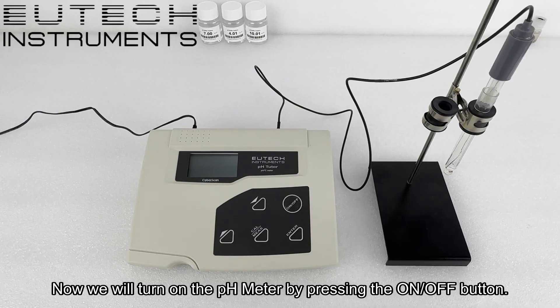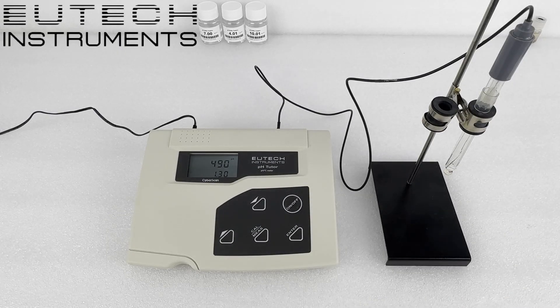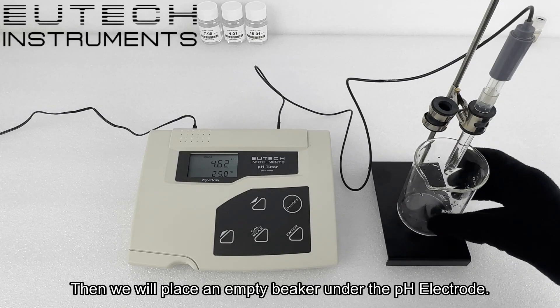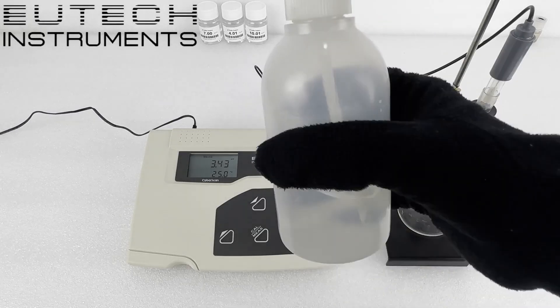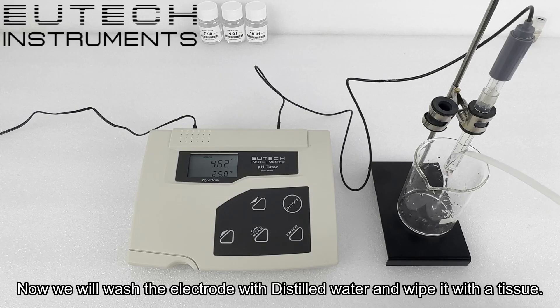Now we will turn on the pH meter by pressing the on/off button. Then we will place an empty beaker under the pH electrode. Now we will wash the electrode with distilled water and wipe it with a tissue.